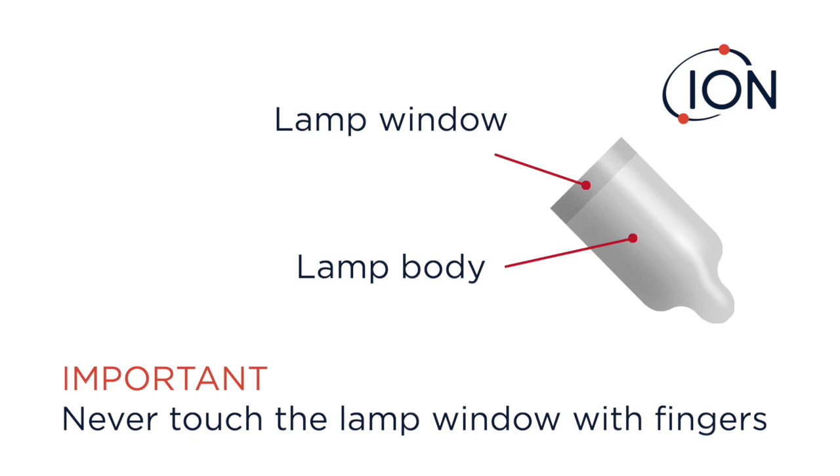When handling the lamp, hold the lamp by the glass body. It is important to avoid placing fingers on the window of the lamp to prevent the window from being contaminated by finger grease.